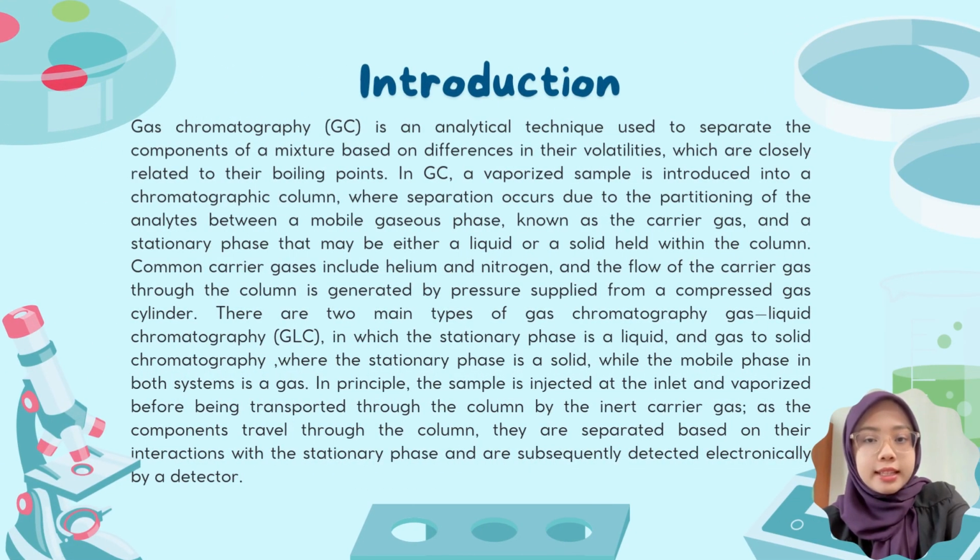So, what is gas chromatography? Let me simplify it. Gas chromatography is an analytical technique used to separate mixture components based on their volatility and boiling points. A vaporized sample is carried by an inert gas, such as helium or nitrogen, through a column containing a liquid or solid stationary phase. When separation occurs due to their different interactions, the separated components are then detected electronically.